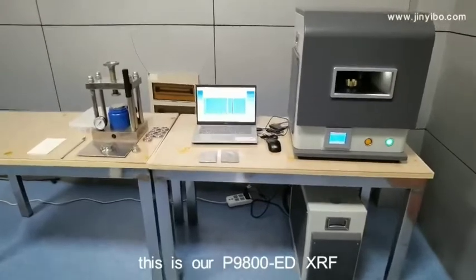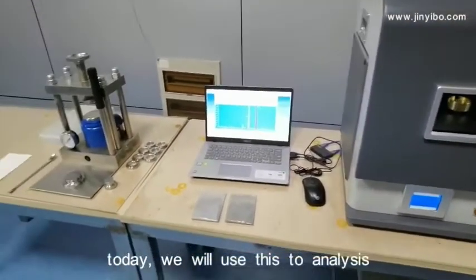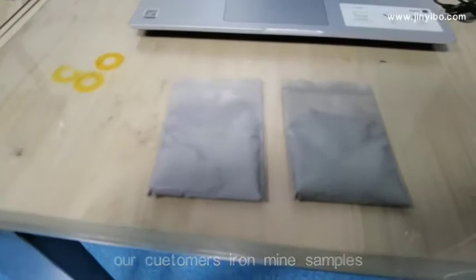This is our P9800-ED XRF, and today we will use this to analyze our customers' iron mine samples.